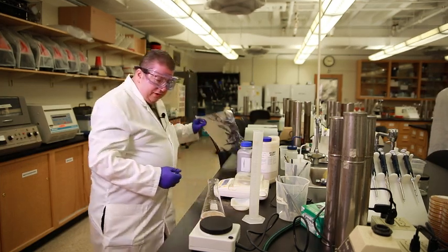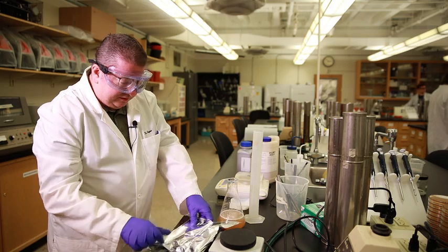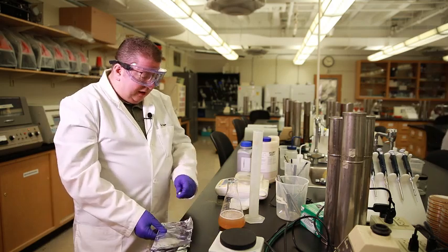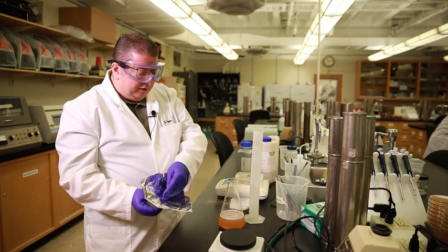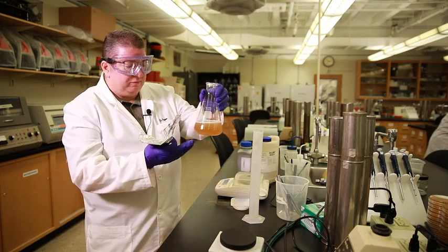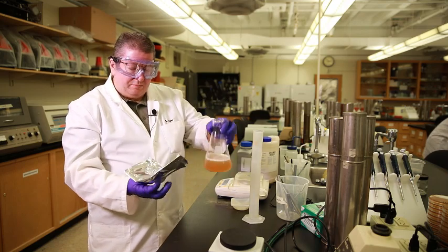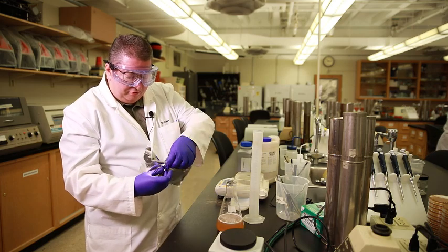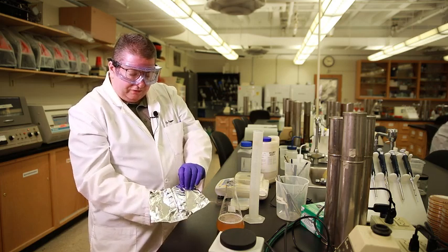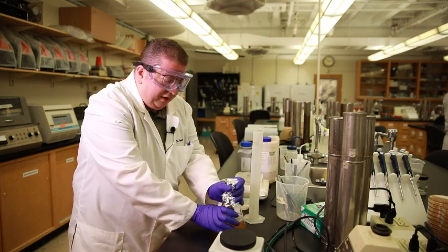Now to prepare my flask for the autoclave, I'm going to use a piece of aluminum foil. And what I like to do is put a stir bar in the foil, because when this agar dissolves in the autoclave, it sinks to the bottom. We want it to be evenly mixed. And it's easy to do that by just taking a stir bar, putting it in the aluminum foil, creating a little butterfly, and then landing that butterfly on the top and crimping it on the flask.